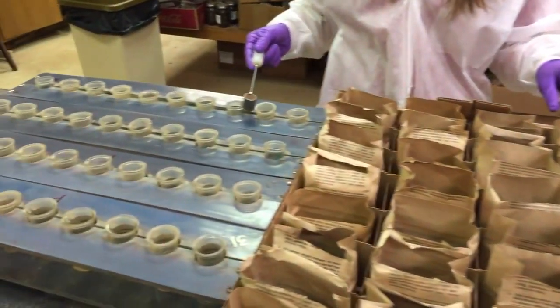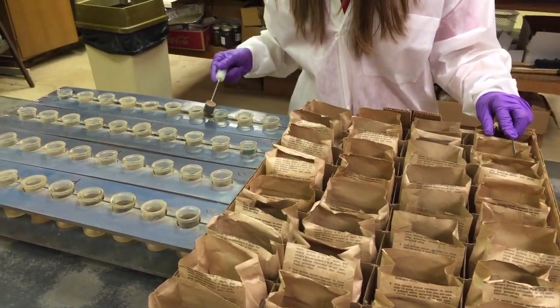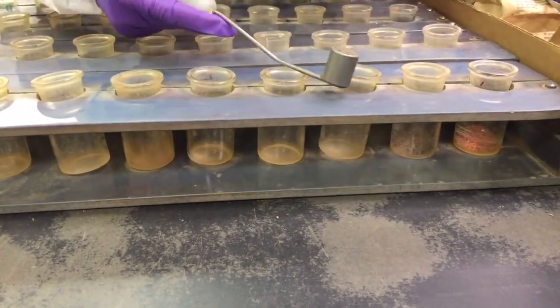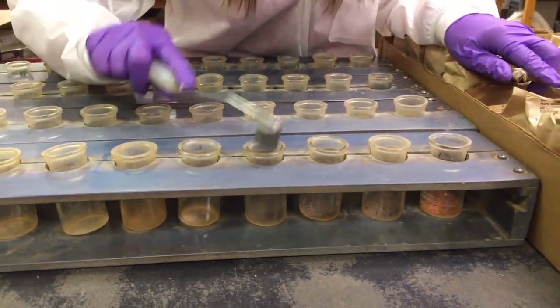Two samples are separated from each submission. One of these will be tested for mineral content, the other for pH or acidity. With each batch, a control sample from a known source is also included to ensure the lab testing equipment is accurately calibrated.